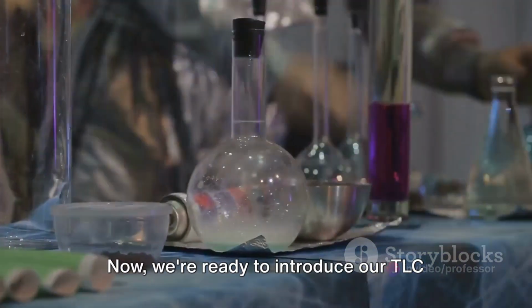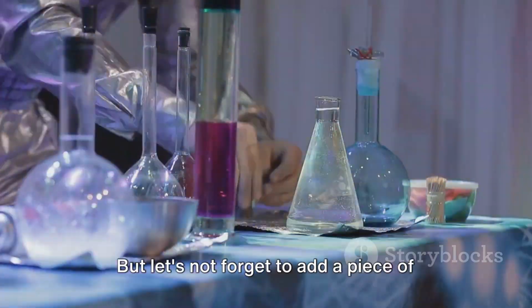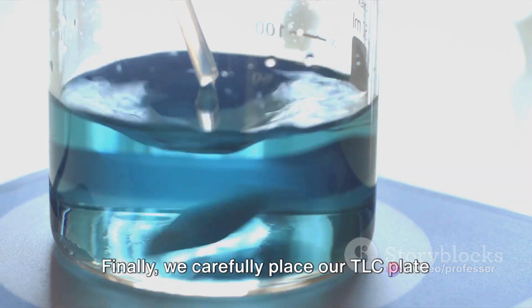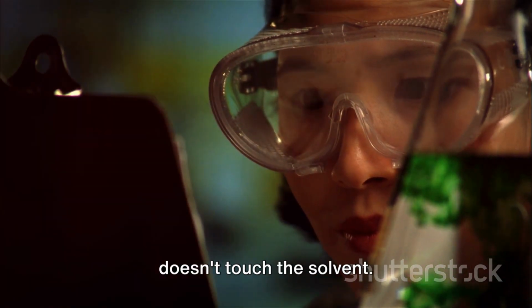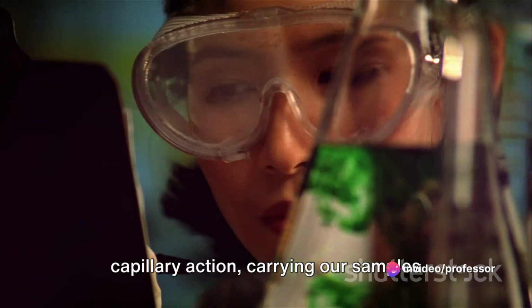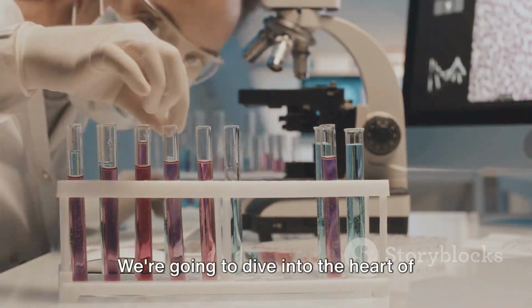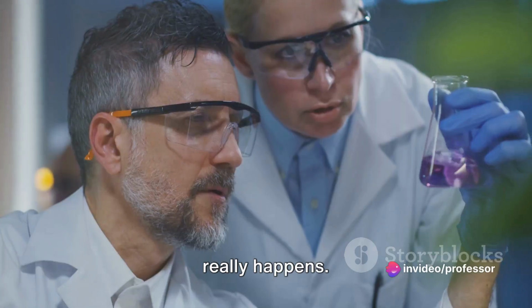Now we're ready to introduce our TLC plate into a developing chamber, often a simple glass jar. But let's not forget to add a piece of filter paper soaked in solvent to the chamber. This ensures a saturated atmosphere, promoting even development of spots. Finally, we carefully place our TLC plate in the chamber, ensuring the baseline doesn't touch the solvent. The solvent will rise up the plate by capillary action, carrying our samples along with it. And voila, we have our TLC plate ready. What's next? Now, the real action begins, the development of TLC. We're going to dive into the heart of thin layer chromatography, where the magic really happens.